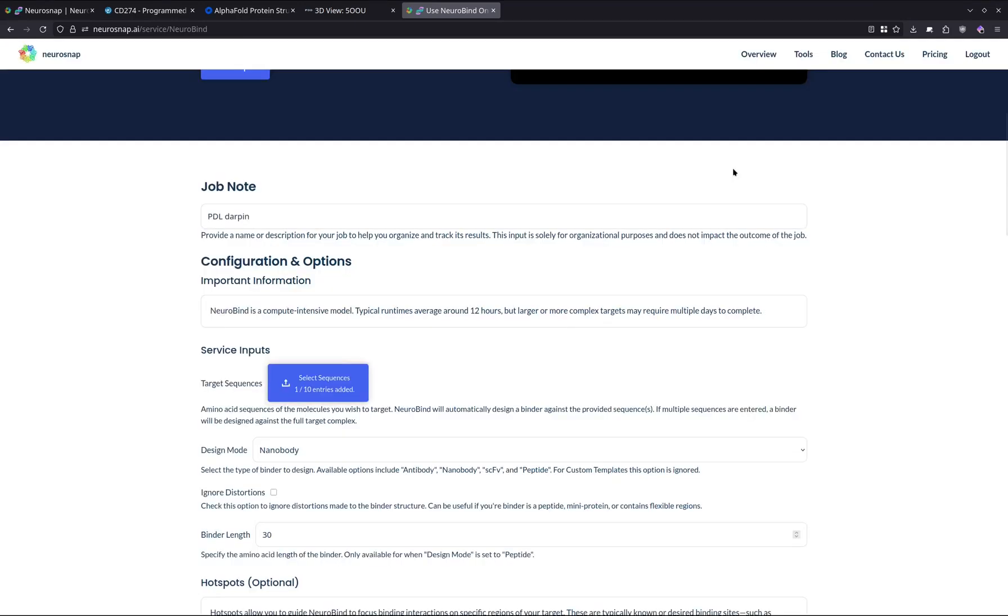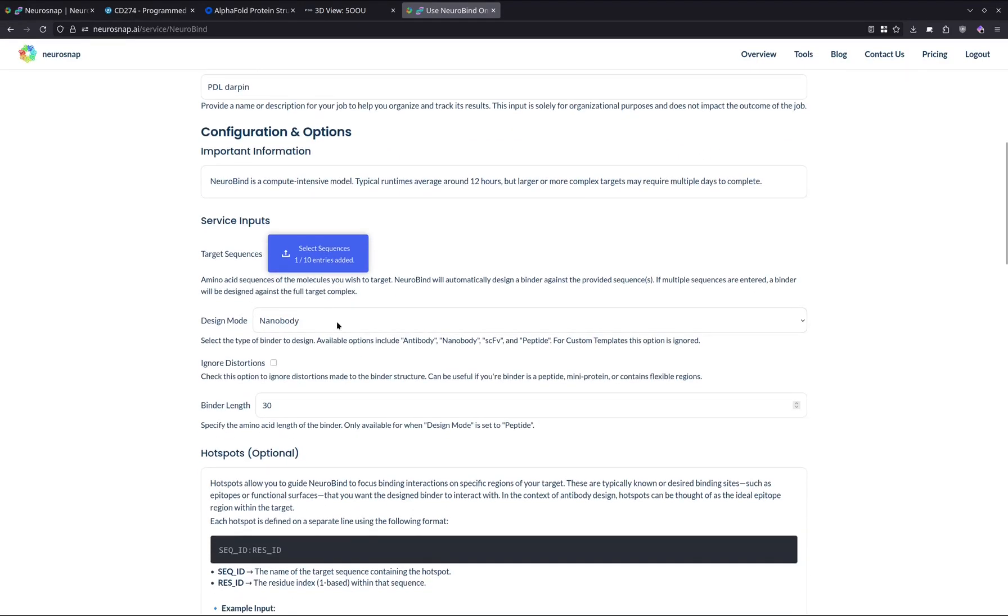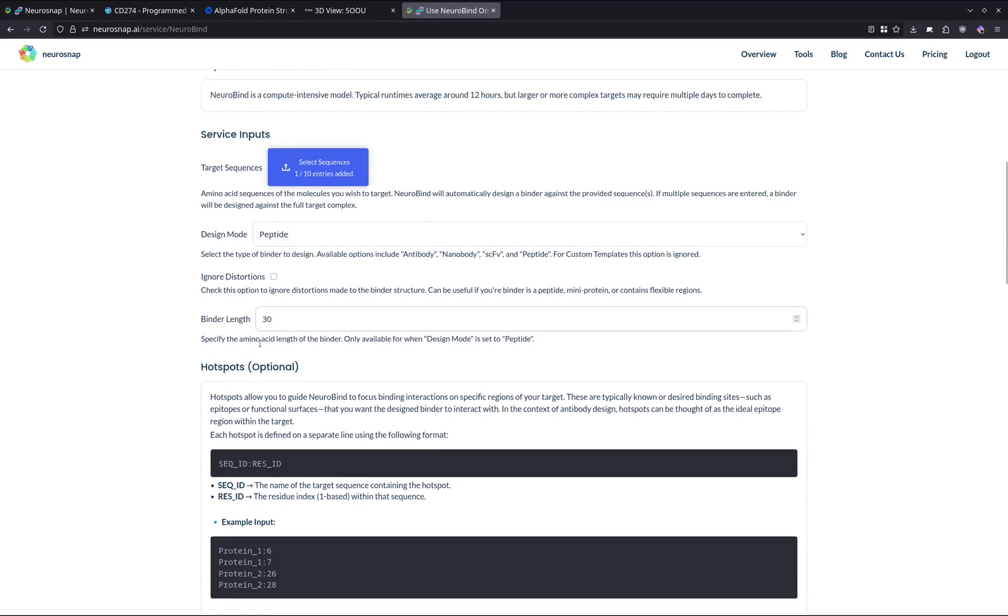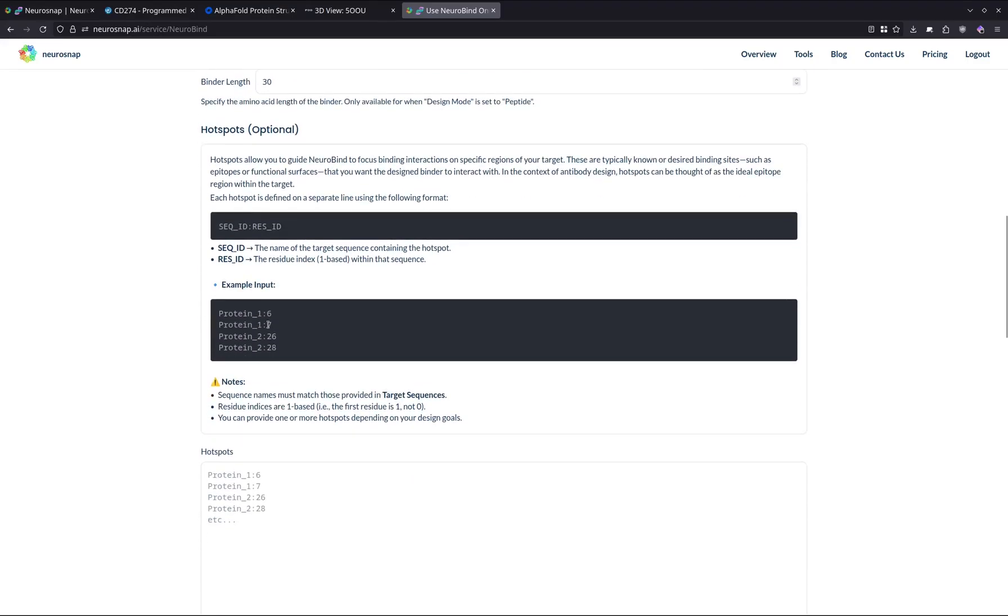Now after we've entered the amino acid sequence, we have a couple of different options that we can explore. In our case, we're going to be designing using a DARPIN, so this particular mode is going to be ignored. But if you'd like, we have nanobody mode, antibody, SCFE, and peptide modes already built in, so you can just automatically design those without having to supply a template. These options are also applicable, but in our case we don't really need to use them, so we can just skip to the hotspots.